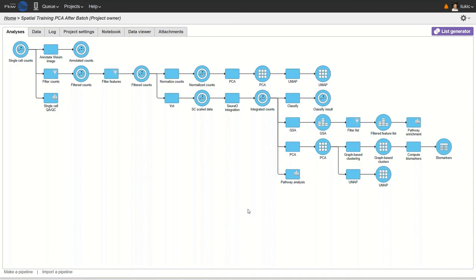So, start to finish analysis in Partek Flow. I hope this was informative. I hope this was interesting for you. And I would just now like to thank you for your attention. Thank you.